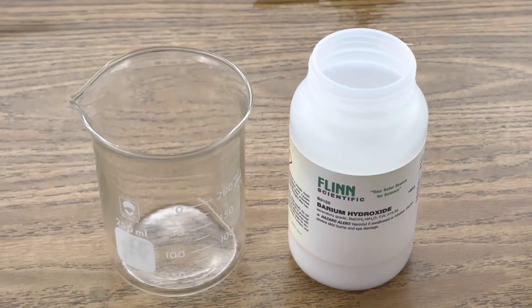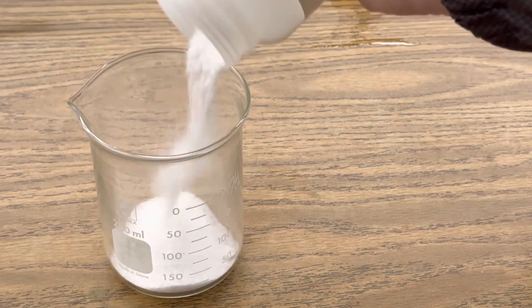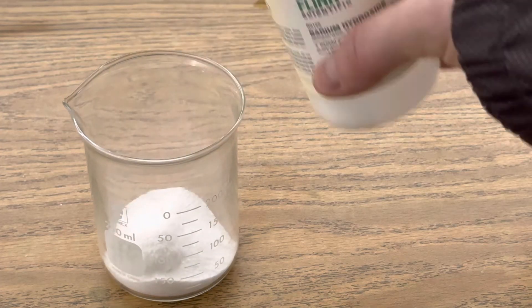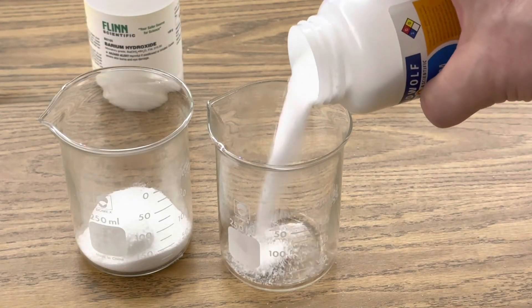The first step is to add some barium hydroxide into my first 250 milliliter beaker. Next, I'm going to add some ammonium chloride into my second beaker.